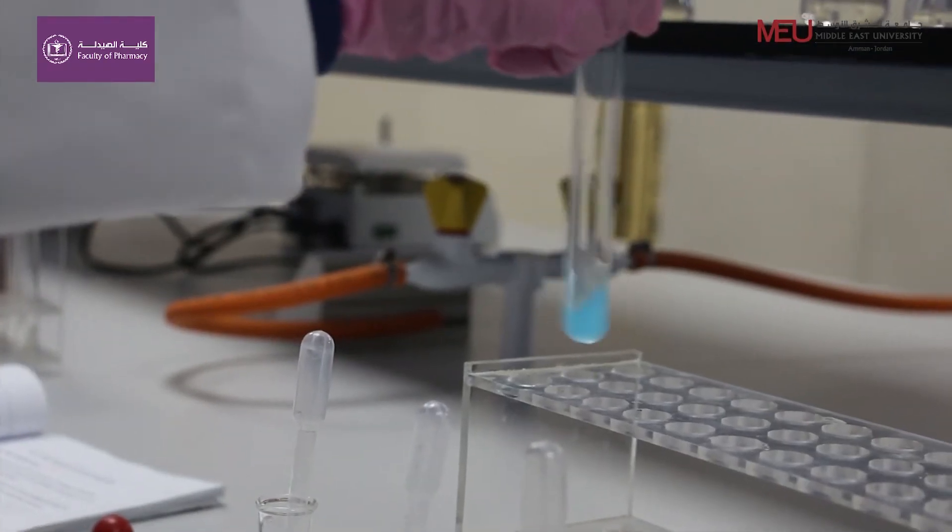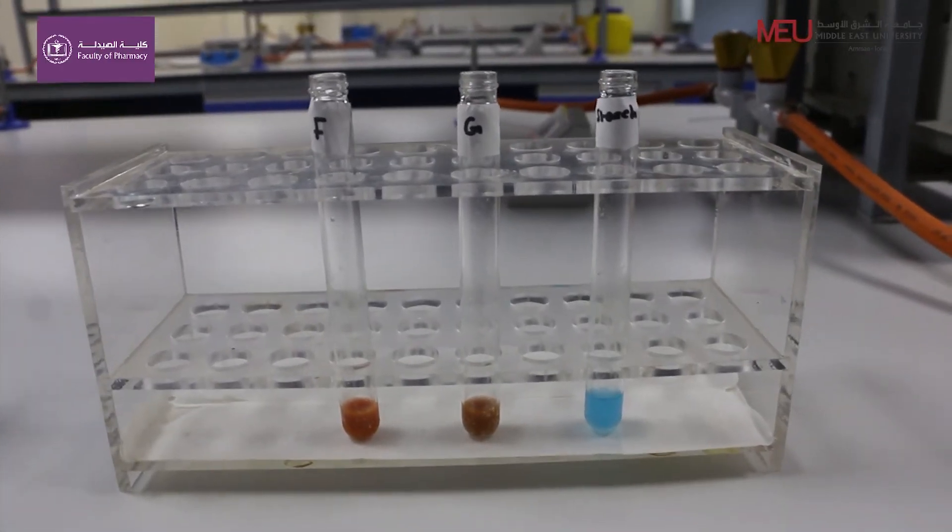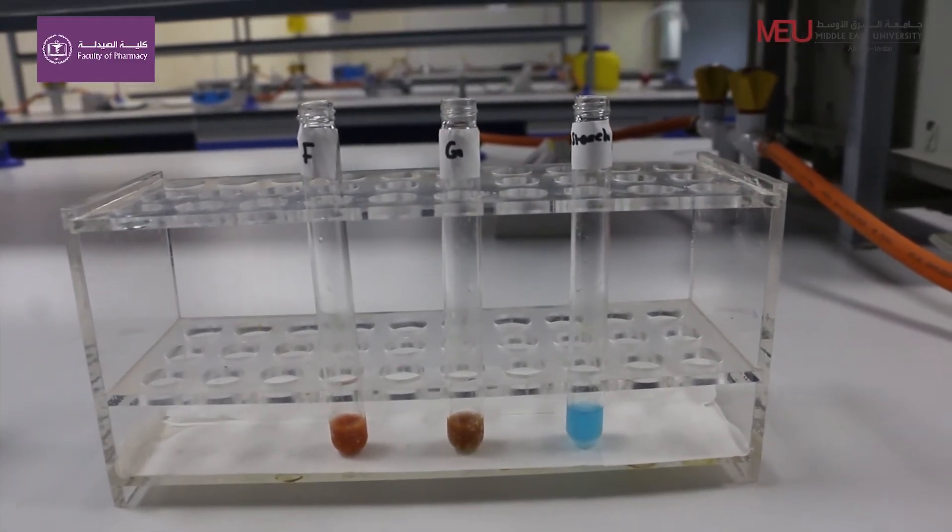Add 2 ml of Benedict's reagent. Mix it and boil it for 3 minutes using the water bath. The color of the mixture is a guide to the amount of sugar in the solution.